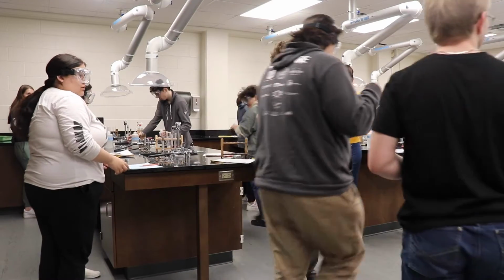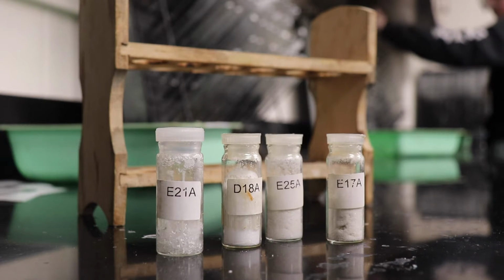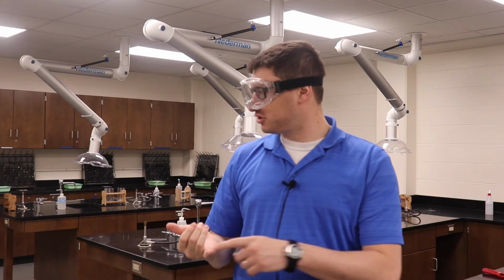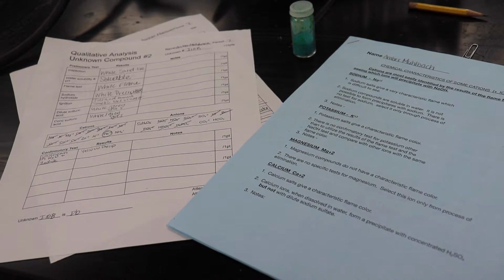The chemistry class has started their annual qualitative analysis lab. The qualitative analysis lab is a multi-week lab where kids are given an unknown compound and a list of what properties any one of those compounds can have. And based on their physical and chemical properties, they're going to have to narrow it down from 15 or so total anions or cations and eventually narrow it down to one of each.